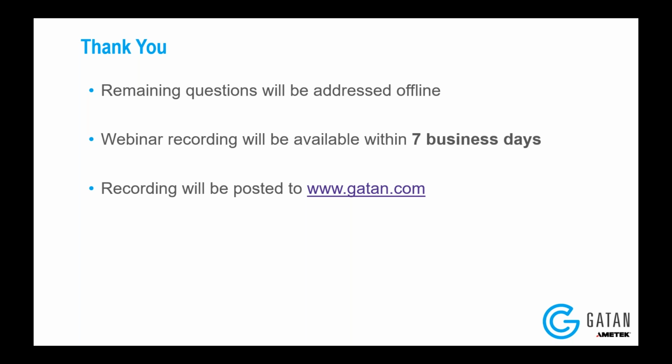So you can essentially acquire 1 single frame readout that's exposed for 30 seconds and then read out. And you can also choose any frame rate between that upper and lower limit. There isn't a set of frame rate options that you can use. It's very, very variable.